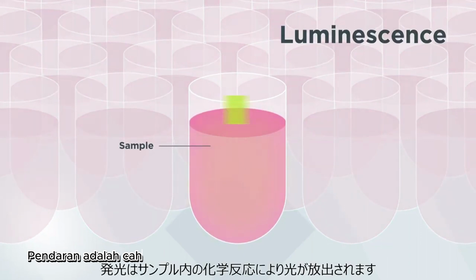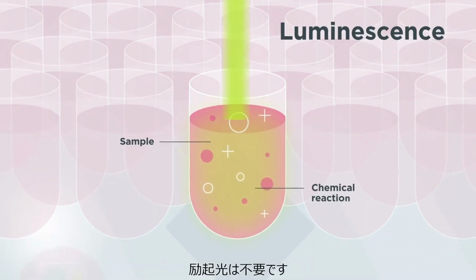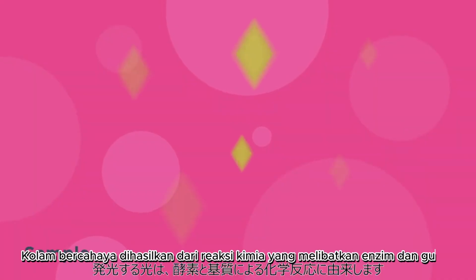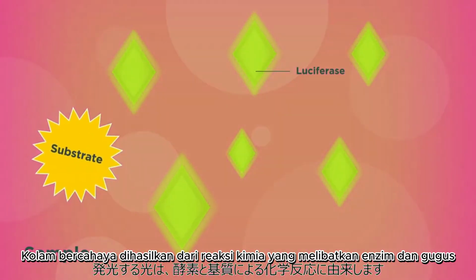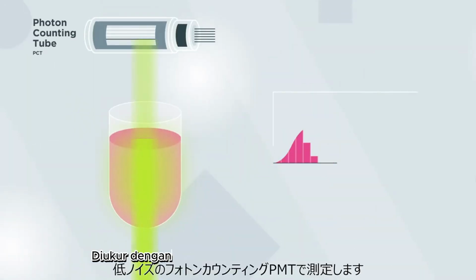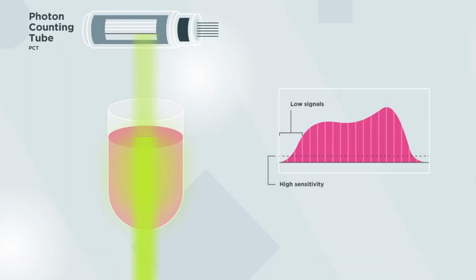In luminescence, light is emitted by the sample as a result of a chemical reaction. No light source or excitation system is needed. The light produced is the result of a chemical reaction between the enzyme luciferase and a substrate. It is then measured by a photon-counting tube, a low-noise PMT, which can detect low signals with the highest sensitivity.